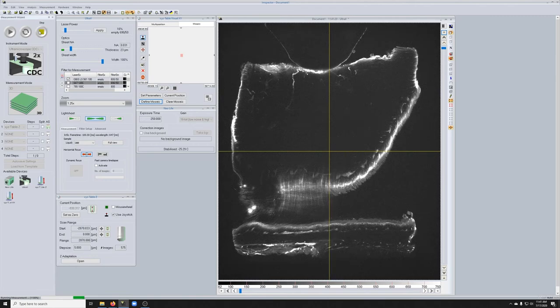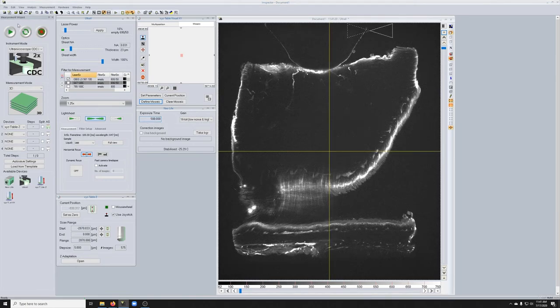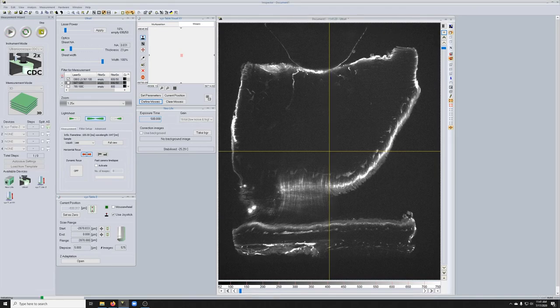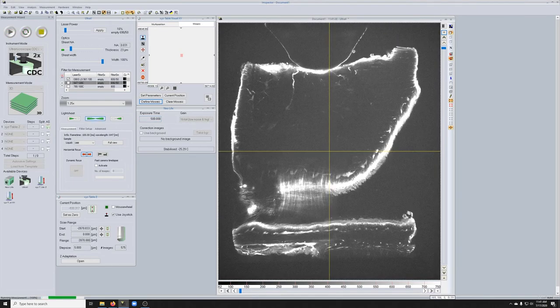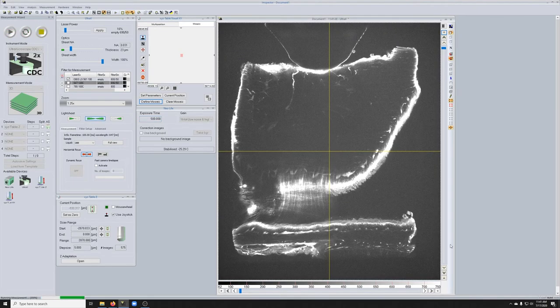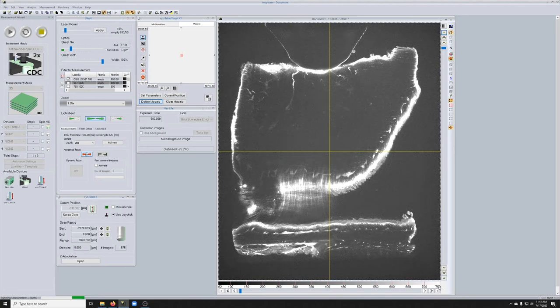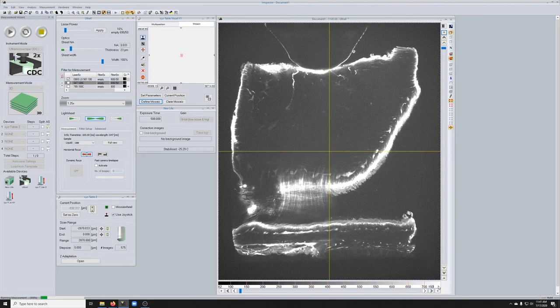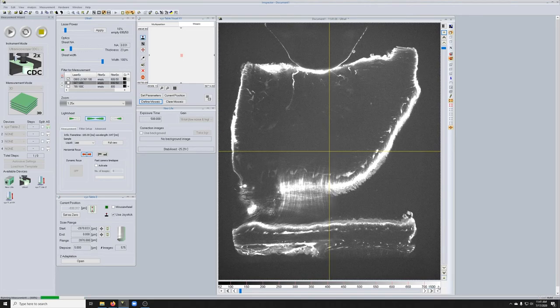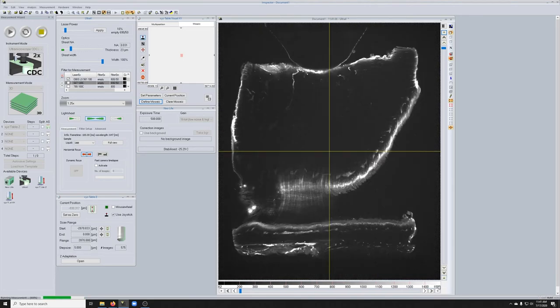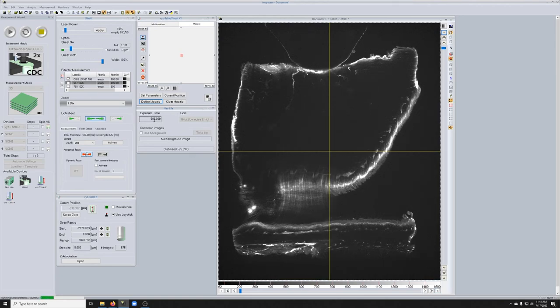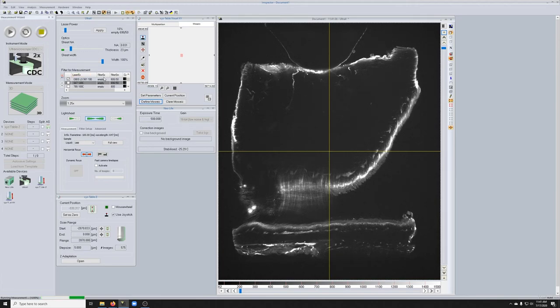Let's double the exposure time and see what happens to the quality. Now, obviously the image will get brighter, but what we want is to understand what happens with the contrast. I'm going to double this parameter down here. You can see everything looks much smoother. I doubled this because we doubled the exposure to kind of have an image of sort of similar brightness. You can see this looks much better.